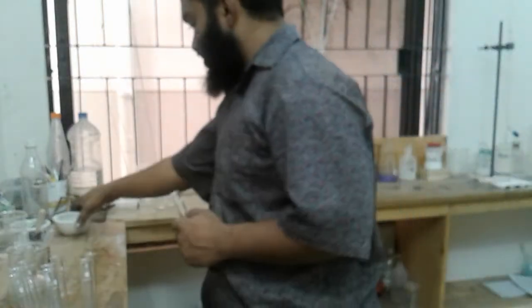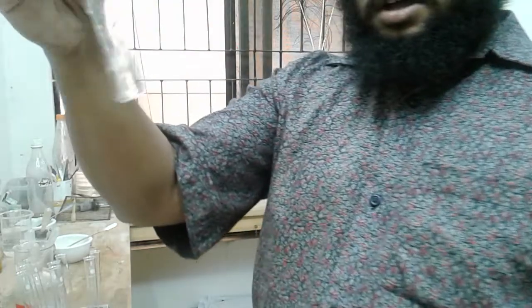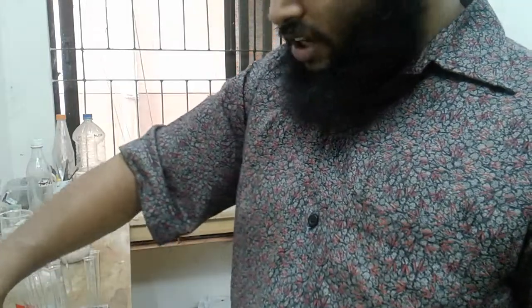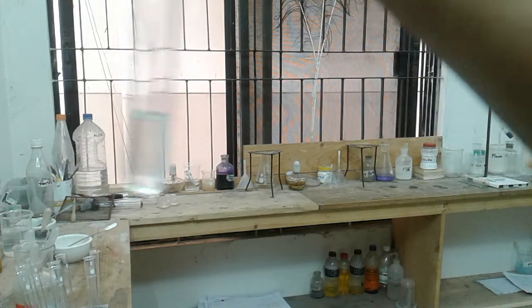Okay, so this is FA1A. We are adding a very small amount, a very small spatula. And then we have added a small amount of distilled water to dissolve the solid, and here is the sodium hydroxide. Okay, so first let's add small amounts.